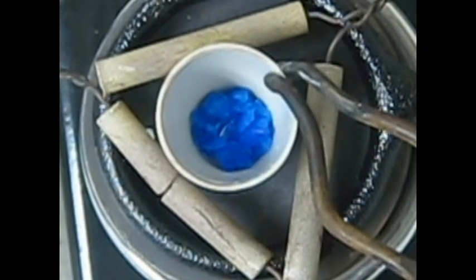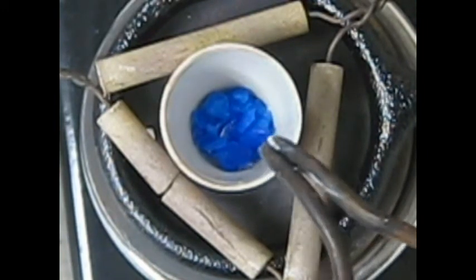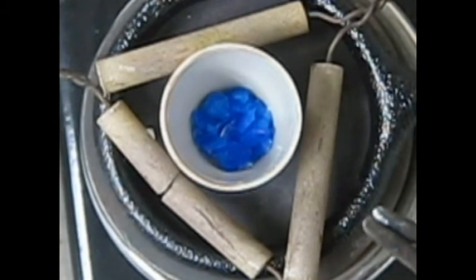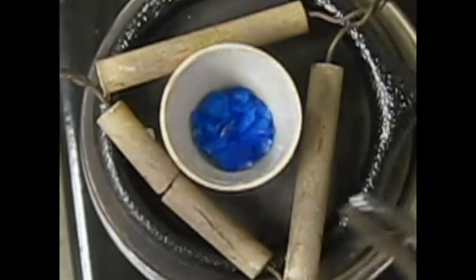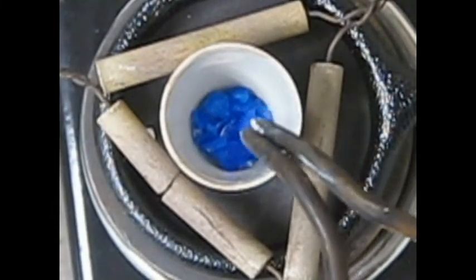I'm going to grab it on one side and have it firmly. Okay. I'm going to leave this camera running, and we're going to see the color fade. Then I'm going to come back and get the mass of the crucible with the dry salt in it, which will be when it has a color kind of like this, kind of bland and drab like most chemicals, not this beautiful poster child chemical.